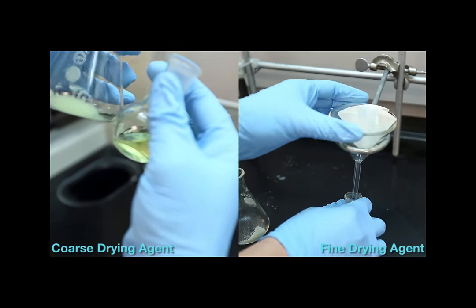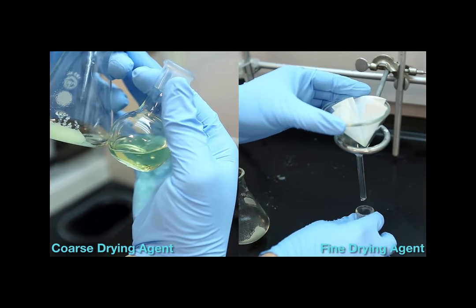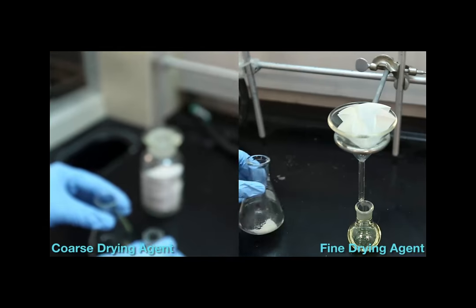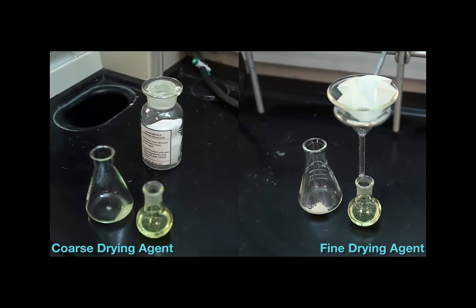After you have removed the solution from the drying agent, which may involve decanting or gravity filtration, typically the next step is to remove the solvent by distillation or using the rotary evaporator.